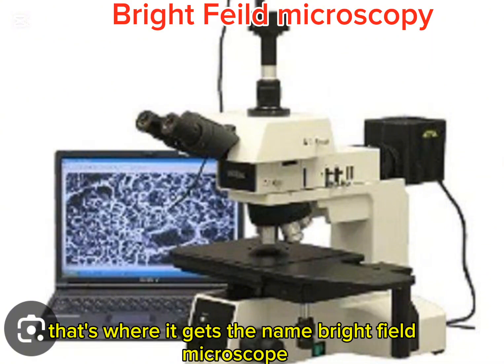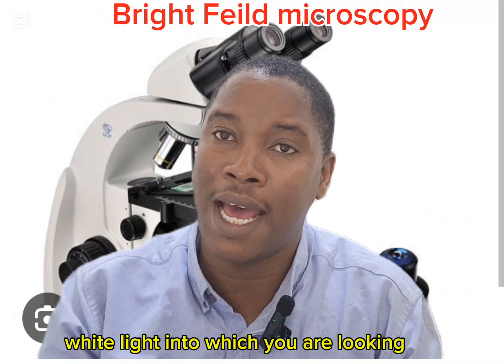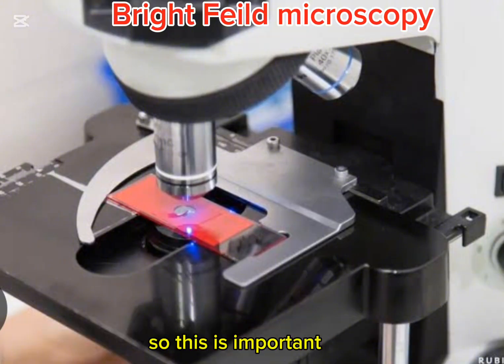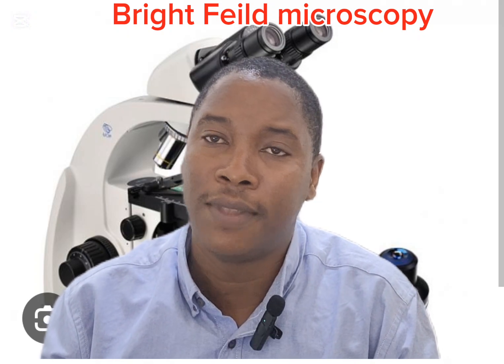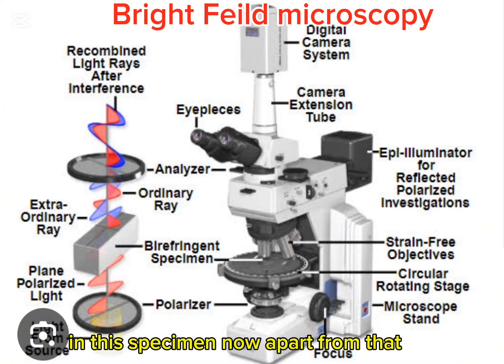That's where it gets the name bright field microscopy, because you are looking into bright white light and trying to make sense of what you can see in the specimen. Different types of bacteria can be seen: E. coli, Staphylococcus, Streptococcus, and many others.